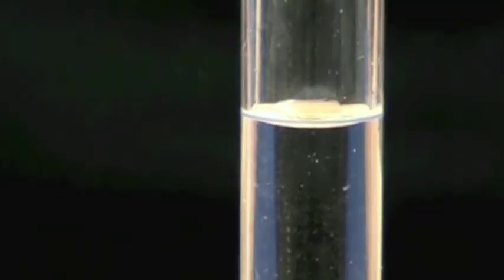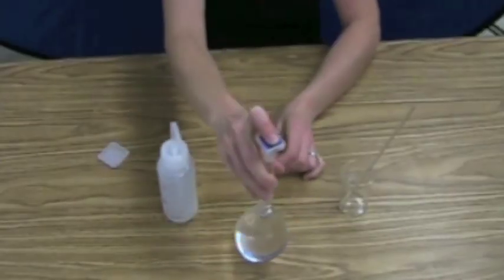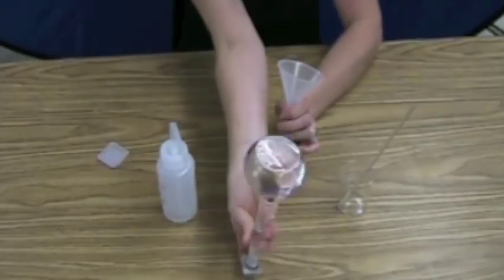Once it's at that line, then you cap it and you invert it about 10 to 20 times just to really make sure that you've really mixed it thoroughly.